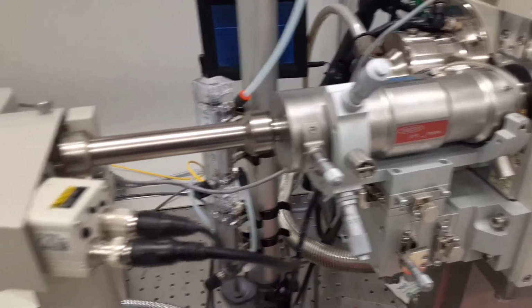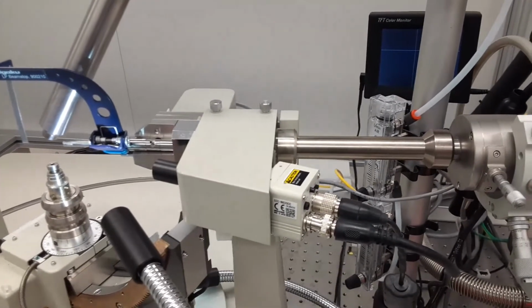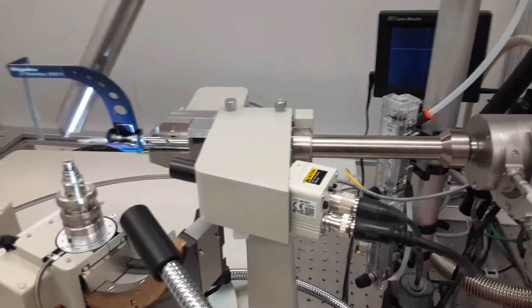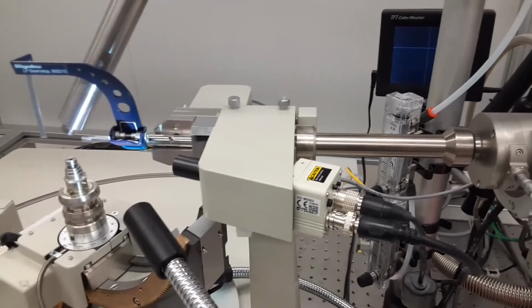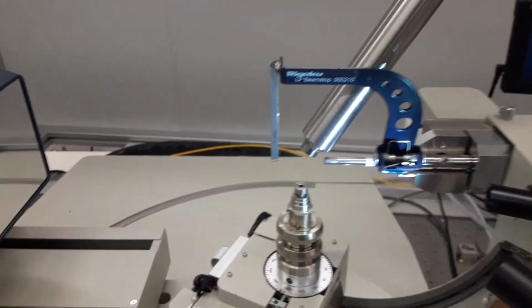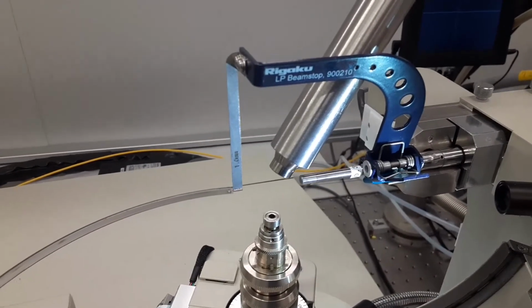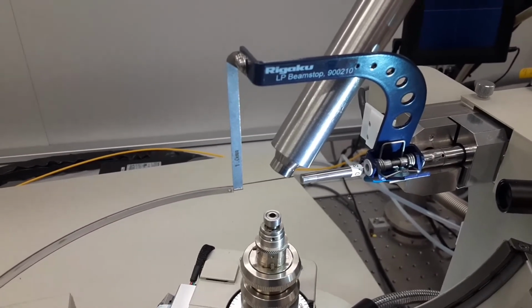After the mirrors, the X-rays travel down the collimator, which has a series of descending size pinholes in it, finally resulting in the end of the collimator here, where we have a 0.3 millimeter pinhole.